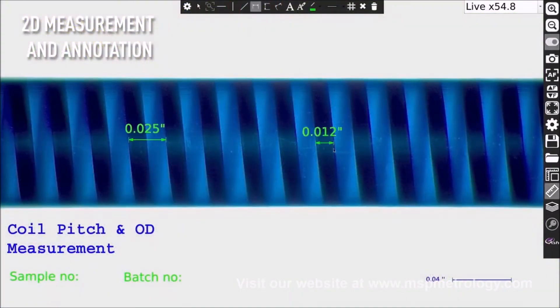2D point-to-point line measurements can be performed and annotations can be captured on images for quick referencing.